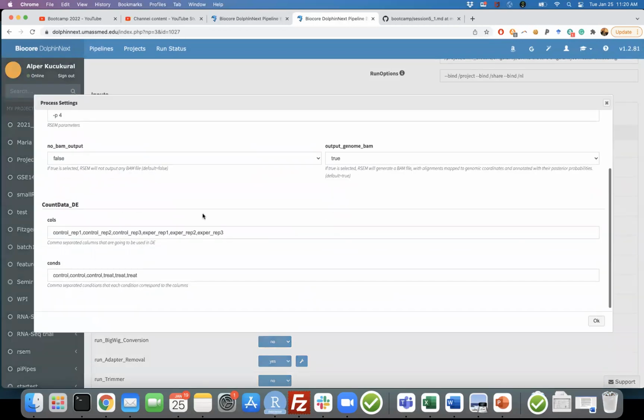Excuse me, Ankur. Yep. I have a small question. Sorry for interrupting. I just wanted to know, when we are filling this form, is it possible for us to enable all the things in parallel, like STAR, HISAT, and everything can be run in parallel? Yes, you can run in parallel. But it's going to take more time.